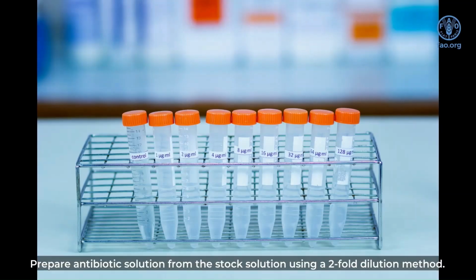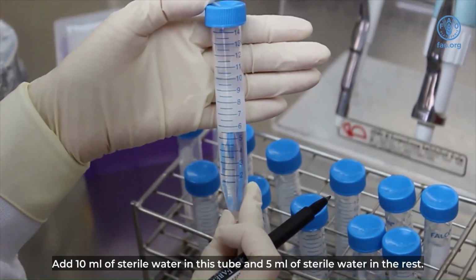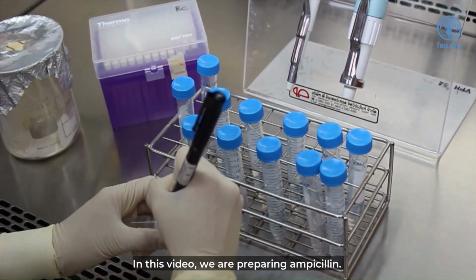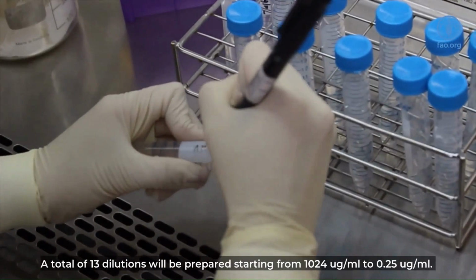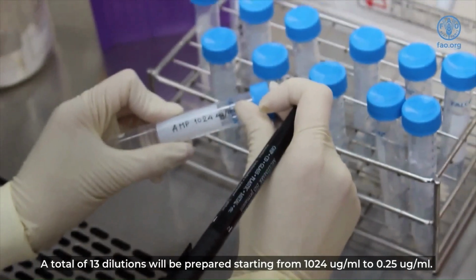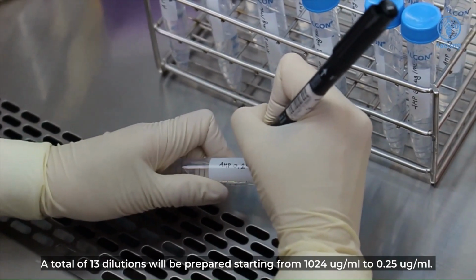Prepare antibiotic solution from the stock solution using a twofold dilution method. Add 10 ml of sterile water in this tube and 5 ml of sterile water in the rest. In this video, we are preparing ampicillin. A total of 13 dilutions will be prepared, starting from 1024 micrograms per milliliter to 0.25 micrograms per milliliter.